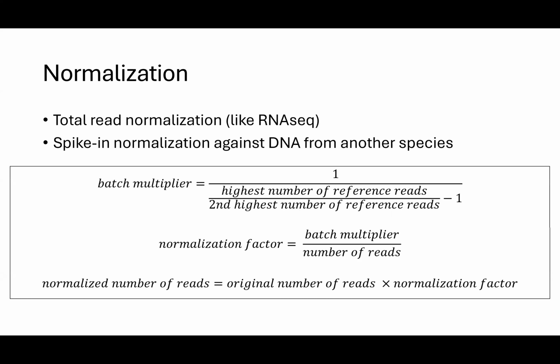I'm going to completely sidestep it. The other thing that I haven't had much experience with, but was going to try to play around with for some newer, older data sets: a lot of people didn't do the spike-in normalization originally, and particularly for CUT&RUN and CUT&Tag, the Henikoff lab that developed those techniques has since shown that there is some E. coli DNA in the Tn5 or in the MNase, and that is enough to normalize the samples often.